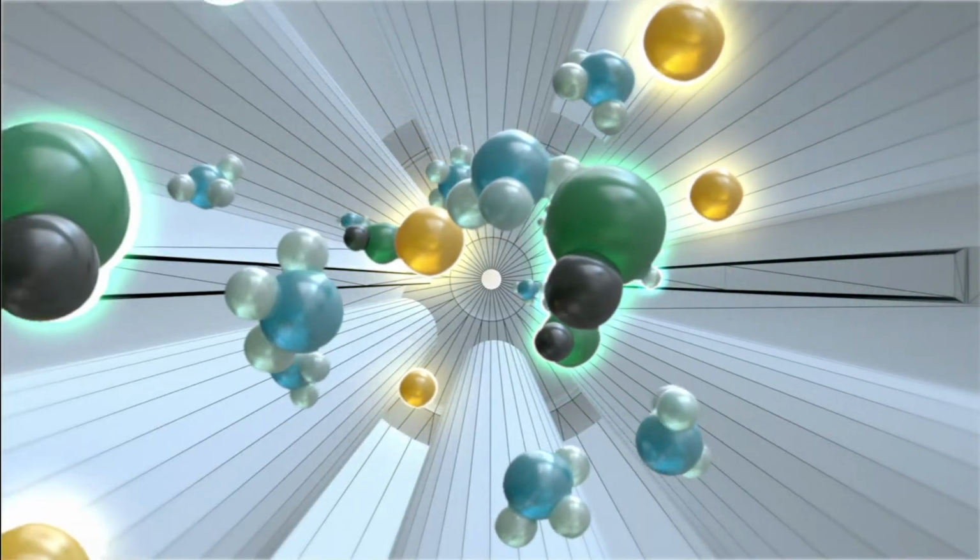And I understand there are a lot of new materials being introduced into the industry right now, kind of everything on the periodic table almost. Are you seeing that as well on your end? Yeah. So maybe 20 years ago, there was a very limited amount of analytes that we look at. That has expanded, and especially for the periodic table, as you said, we're looking at almost the entire periodic table now. So it's quite a bit of an expansion of testing.